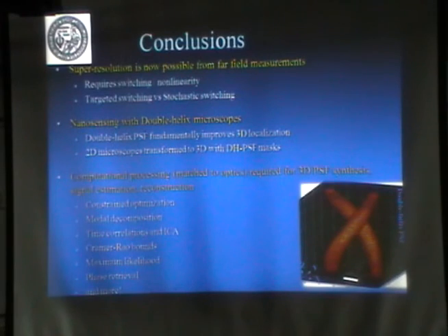So for example, if you want to have smaller spots, you can do it, but it's going to have shorter range. If you want to have a faster rotation, you're going to have less efficiency. So all these parameters you can play around with, and it's similar to the lens where you control the numerical aperture. There are trade-offs. Increase the numerical aperture, you have better resolution but lower field of view.